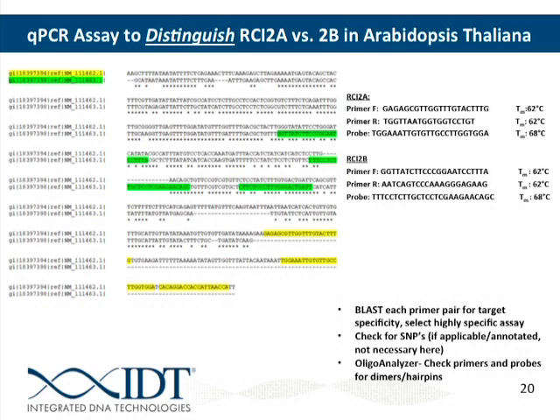So zoom in. Can everybody see that? Okay. And so we'll go down to this bottom section. All of this can stay the same. What we want to do is target our assay so the probe falls in that particular deleted region. And we can do that here.